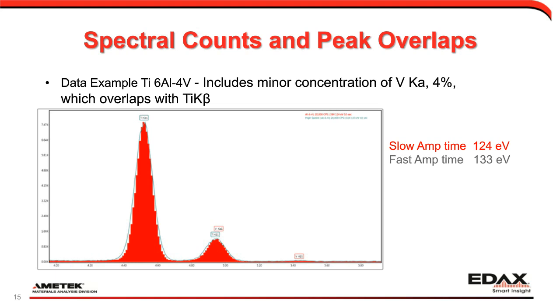No resolution or pulse processor setting would ever separate those two highly overlapping peaks. So now is where we really need to rely on the software, the algorithm, to do its thing. And the software is, of course, going to work best when you have a greater number of statistics to work with for the discrimination of which X-ray counts belong to which element.